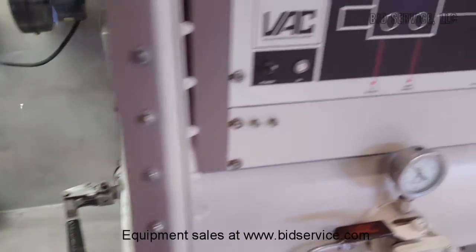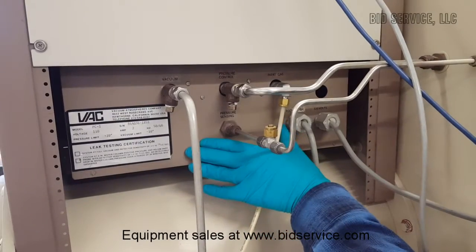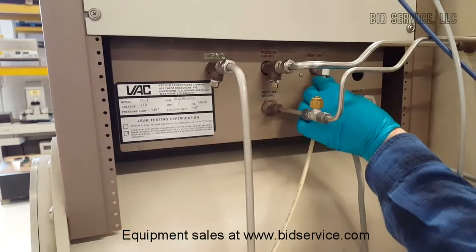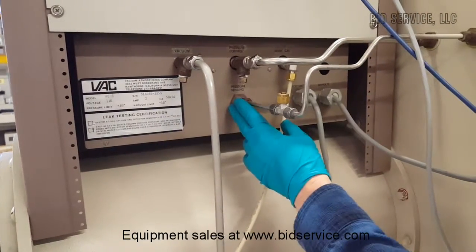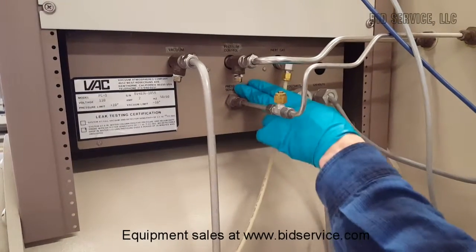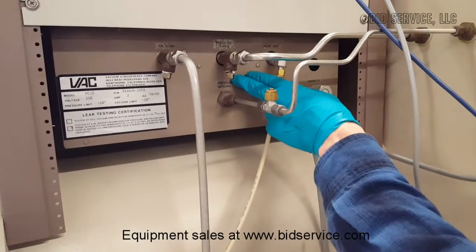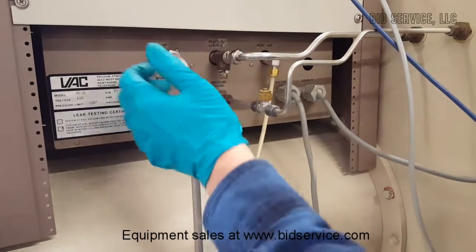Here's the back of our control box — the model PC1. The voltage is 110. Here we have our nitrogen cylinder coming in — that's our inert gas. This is your pressure control, reading what the pressure is inside the box. This is the pressure sensing; it reads the pressure and goes to the magnehelic in front. The control has two valves — a vacuum valve and an inert gas valve that open to maintain the pressure of your magnehelic. That's done through this line. Our vacuum from the manifold in the front is just teed off to here.